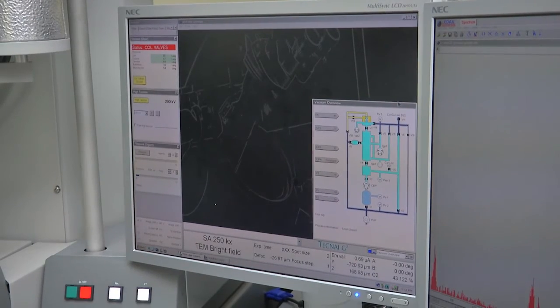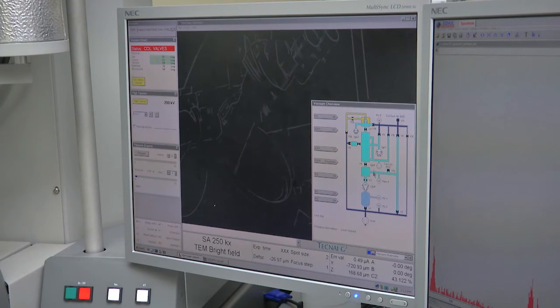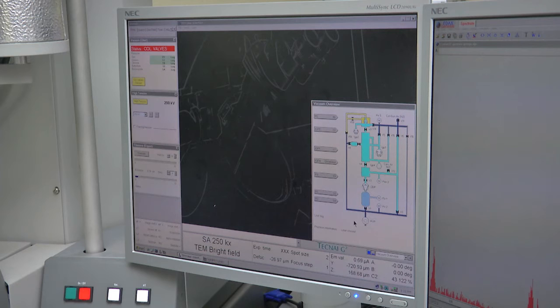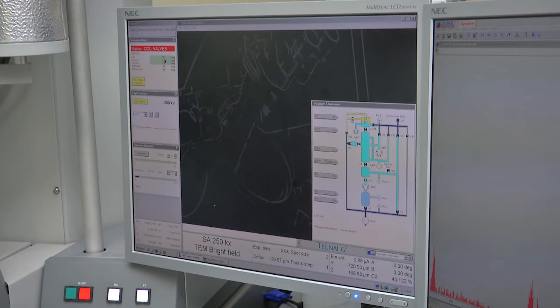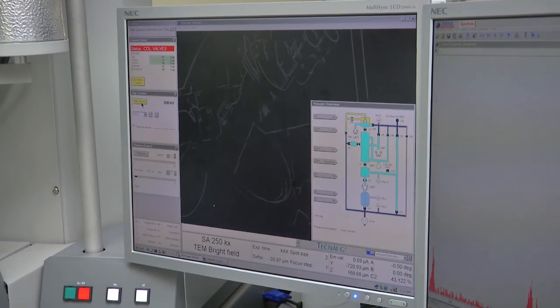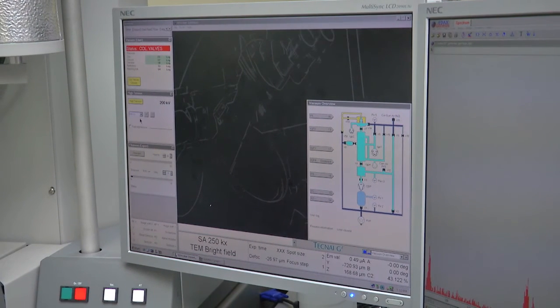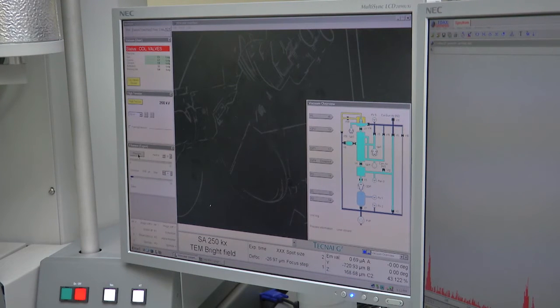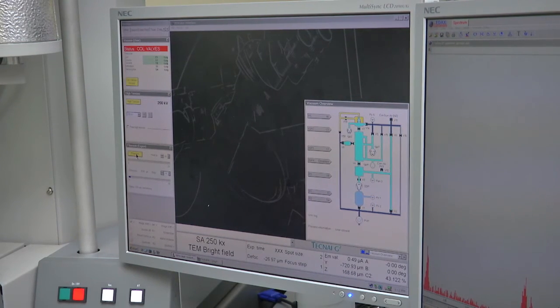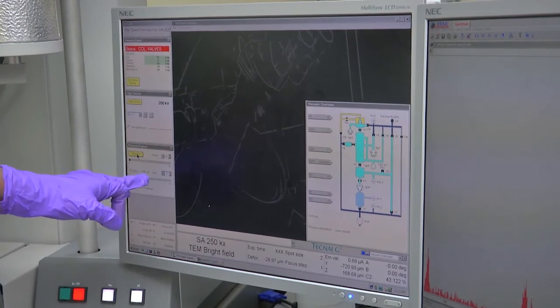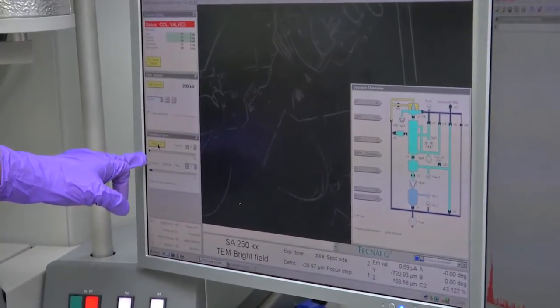This is the vacuum layout of this microscope: there is a rotary pump, oil diffusion pump, and two ion getter pumps because it is a very large column. A vacuum of 10⁻⁷ to 10⁻⁸ torr can be achieved. After the vacuum is established, you see numerical values on the display — the gun should come to nearly 23. I have already selected 200 kV high tension. Now I am heating the filament by pressing this knob — the filament is getting heated up.